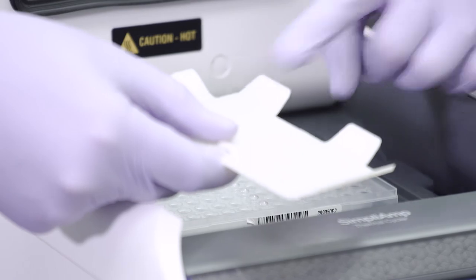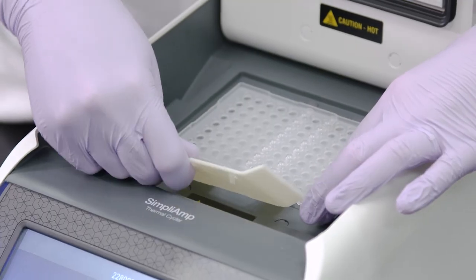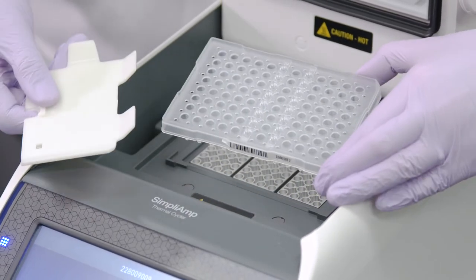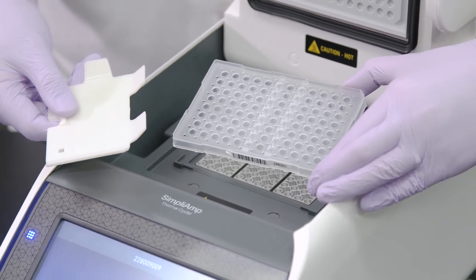Alternatively, you can insert the two-prong side of the multi-removal tool into the long side of the PCR plate and lift to remove the plate from the sample block.